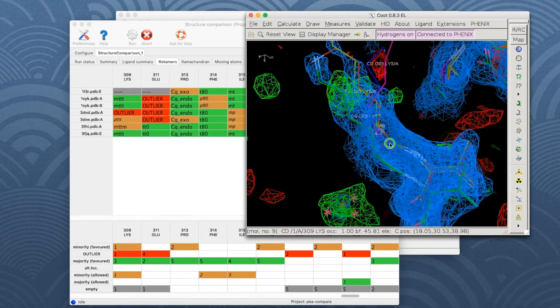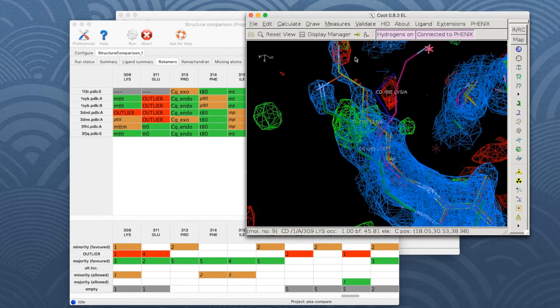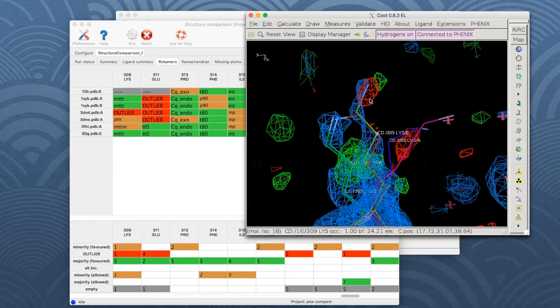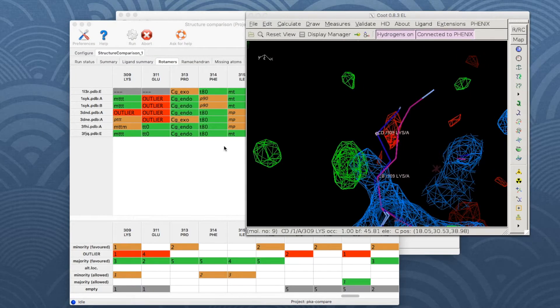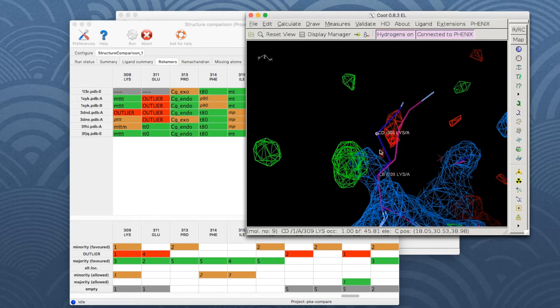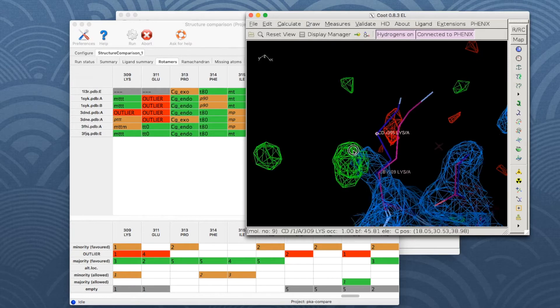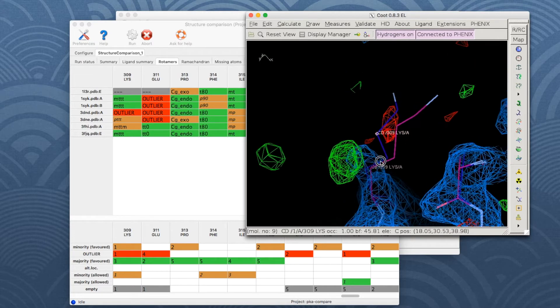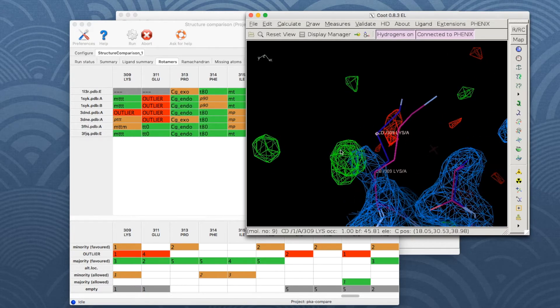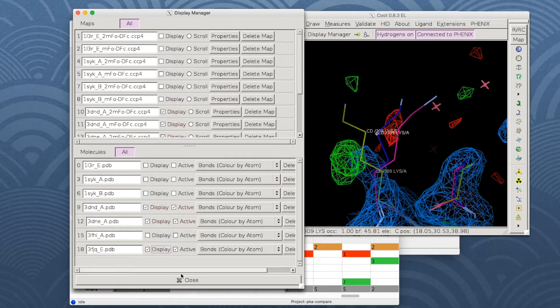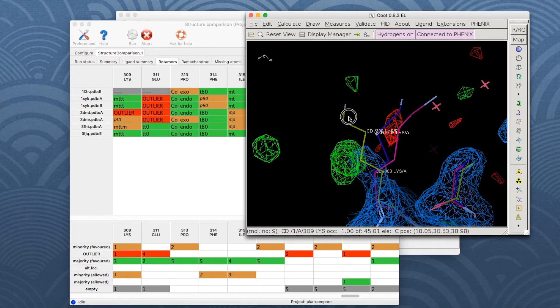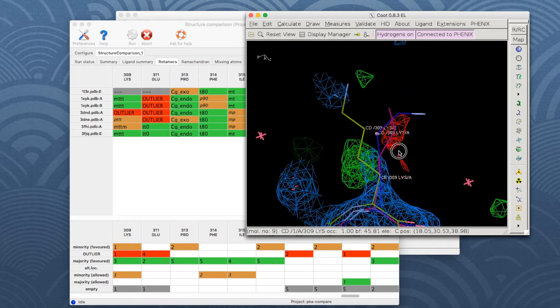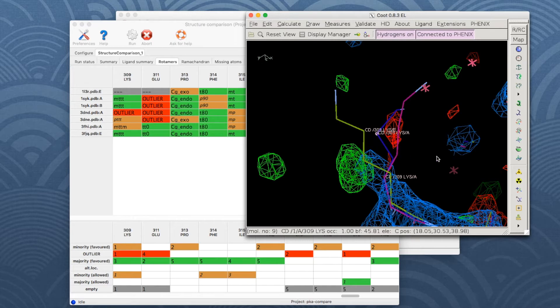Let's focus on the rotamers of 3DND and 3DNE and hide all other maps and models. The side chains point to the right, partly covered with negative difference density, while there is 2Fo-Fc and positive difference density on the left. The orientation of these side chains can be most likely improved by trying to fit them better to the density. It can also be noted that the side chain of lysine 309 in 3FJQ also points to the left. Therefore, the rotamer table can help identifying regions which need further attention.